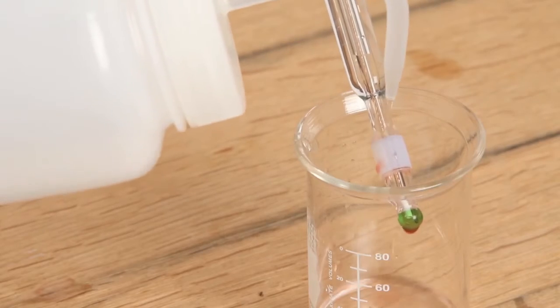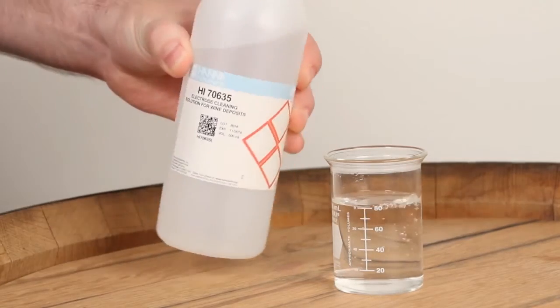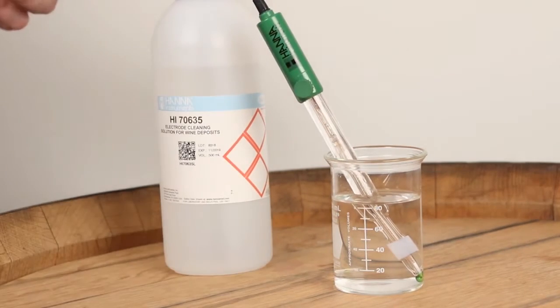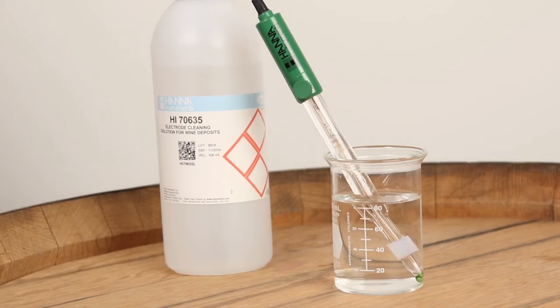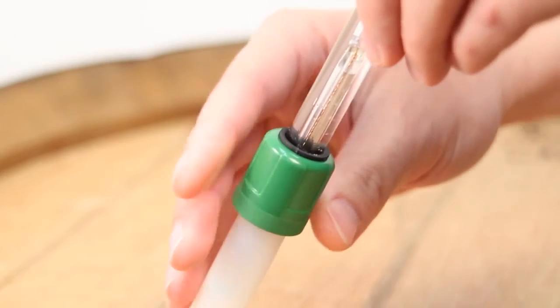So that's it — the Hanna HI 2020W Wine Kit is the right solution for winemakers looking to take their wine analysis to the next level. Before you go, I'd like to go over some cleaning and storage tips. After your measurements, rinse your electrode with distilled water to help remove wine stains. Fill a small beaker with your HI70635 cleaning solution for wine deposits and place the electrode in the solution for 2-3 hours. After, keep your electrode conditioned by keeping it capped and stored in our HI70300 storage solution.